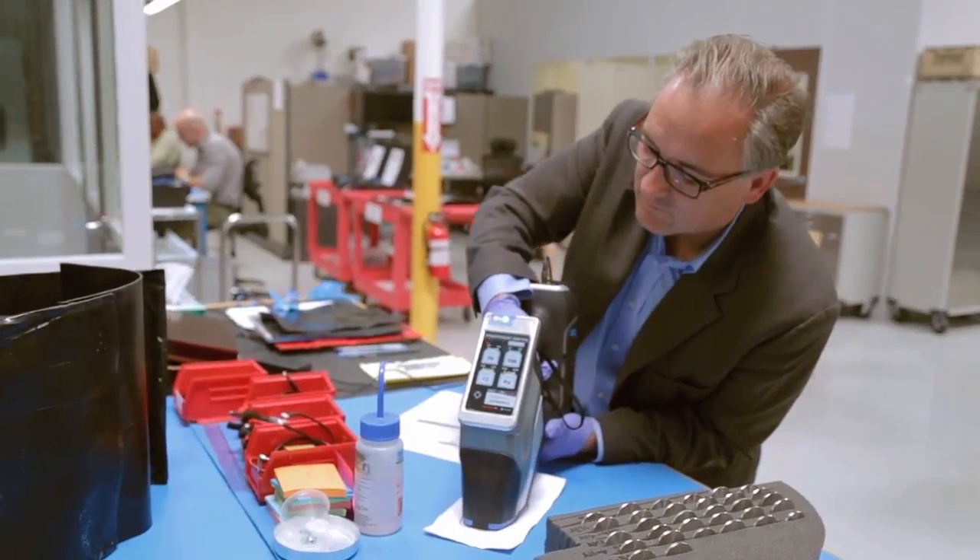The Tribogenics cartridge fits in and out of the Watson and allows you to be operational and have guaranteed uptime. That also allows the low price point that we can offer the unit to the customer.